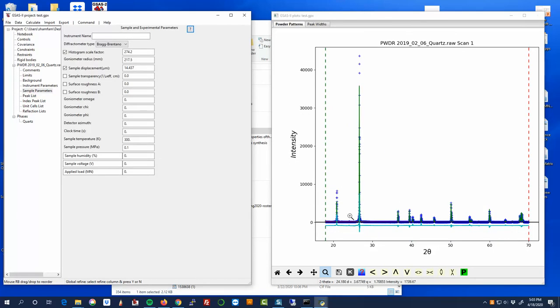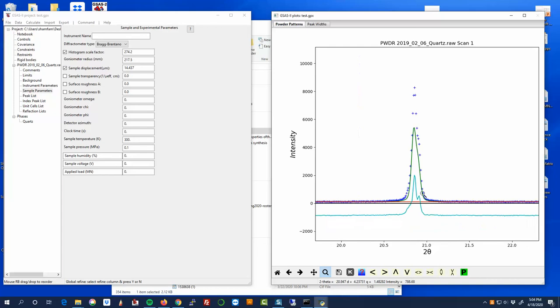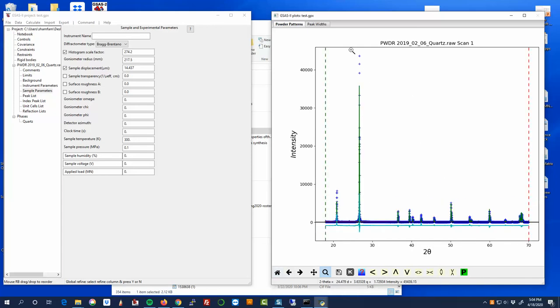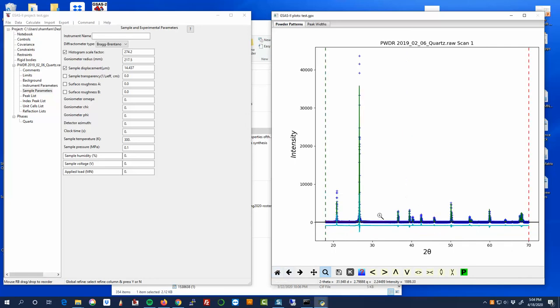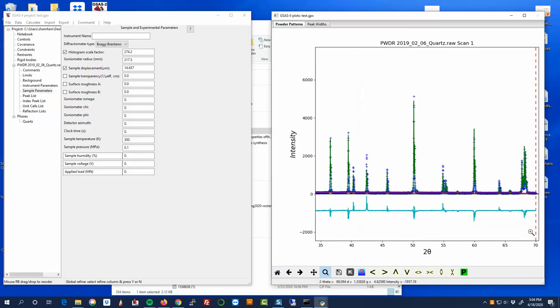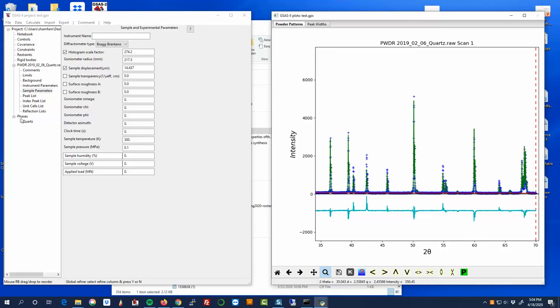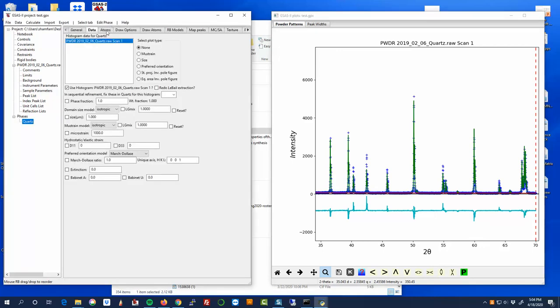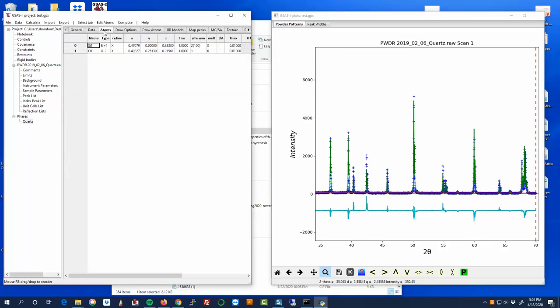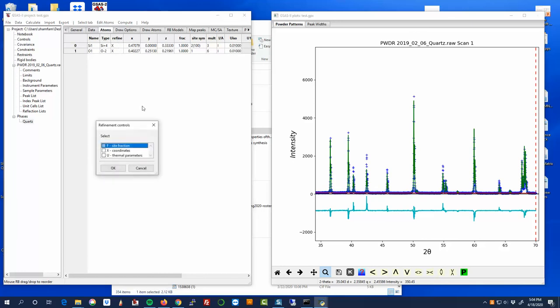And so we're doing a better job. The thing that we're not getting right now is intensities. And so if I look at these, you know, this one, the shape is still not perfect. Let's kind of look in here. You know, in general, we're either under-predicting like this one or this one, or we're over-predicting like this one, this one, this one. This is an under-prediction and over-prediction. So our individual intensities for each of these peaks is not quite right. So we can come back to phases.